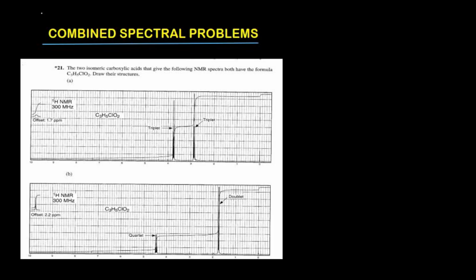I am going to solve yet another problem from the spectroscopy book by Pavia, Lampman and Kriz, and this is problem number 21 of chapter 3, which is given in the exercise. It's quite a simple and elementary problem. It will not take too much time. So first of all, we'll read the question.